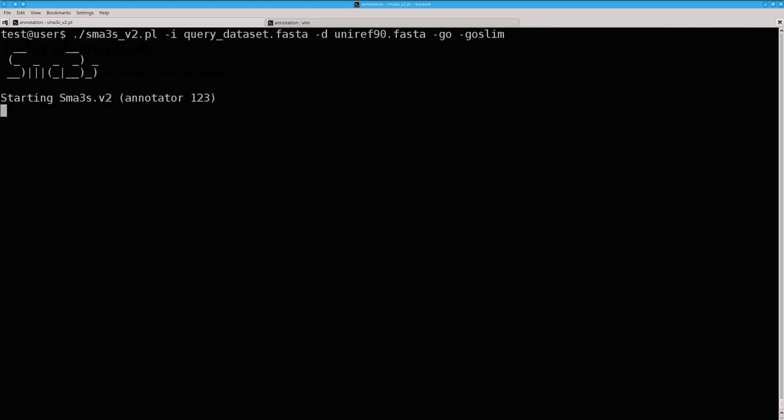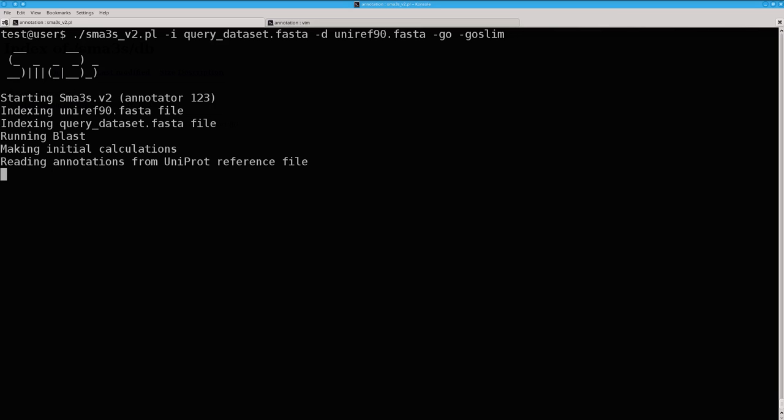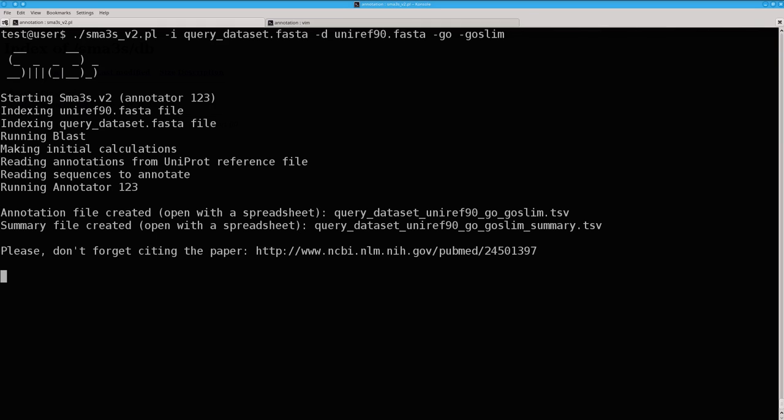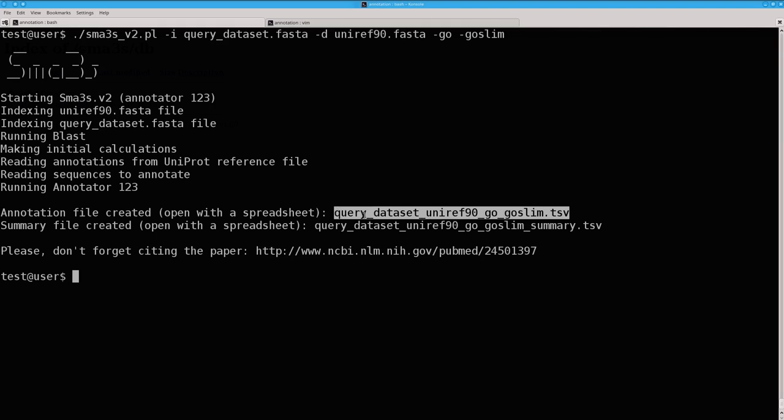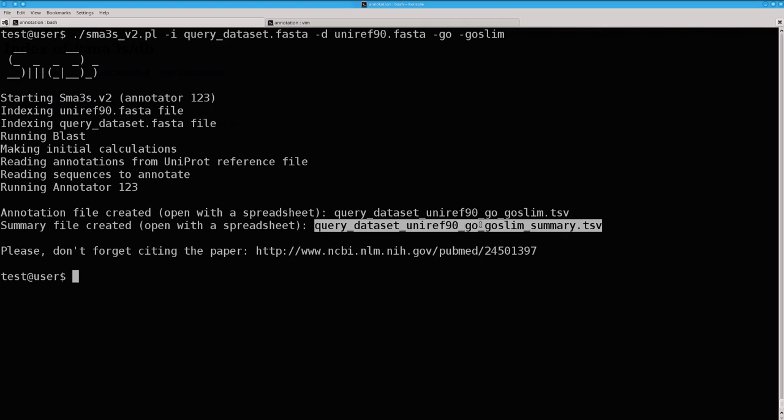Now SMAS3s is running. And when the annotation is ready, you have two different files. They, the two of them, can be opened with any spreadsheet program. These are the two files with the result.